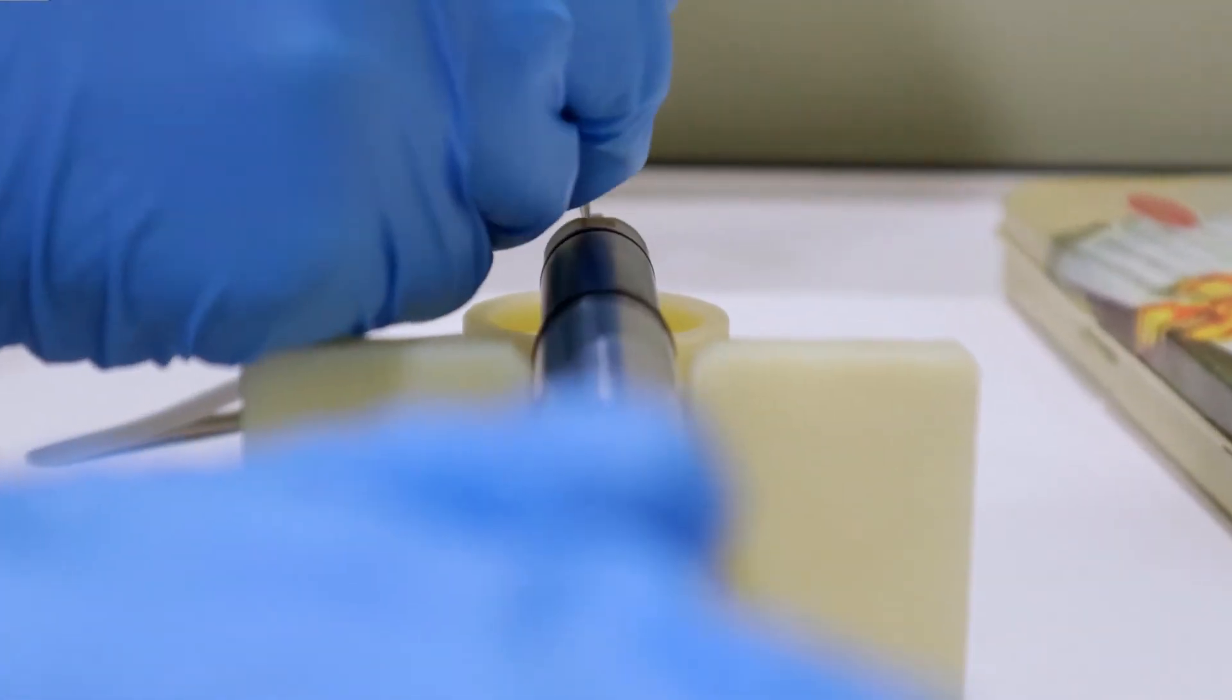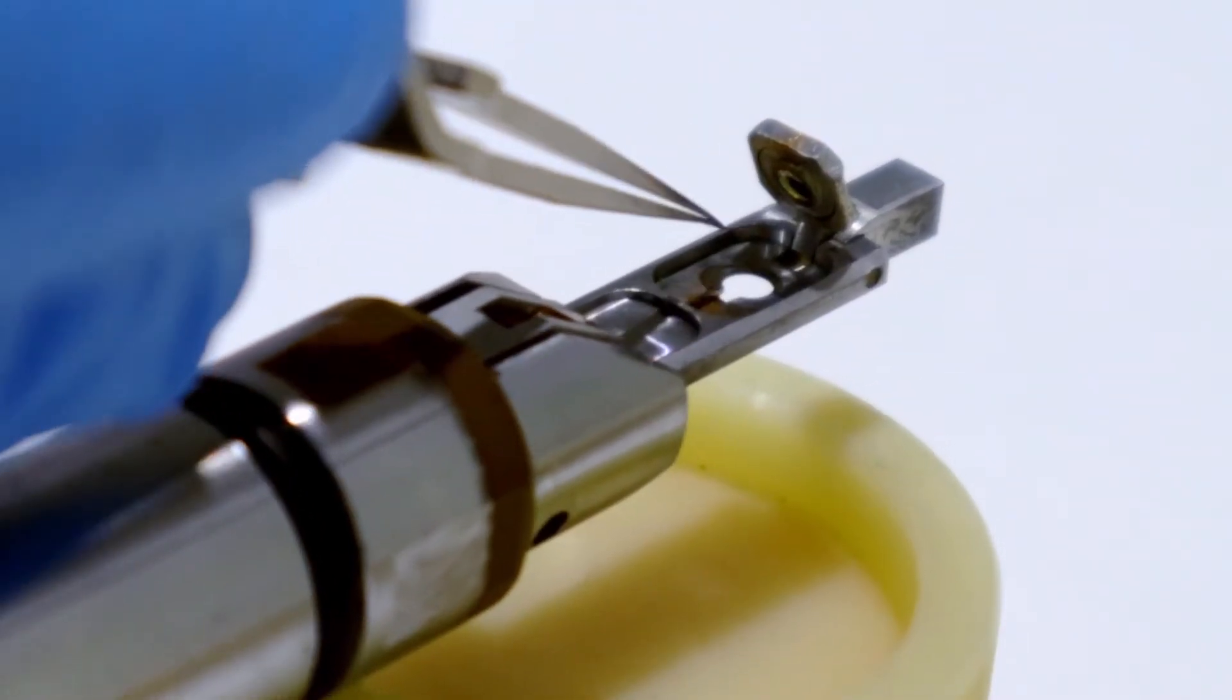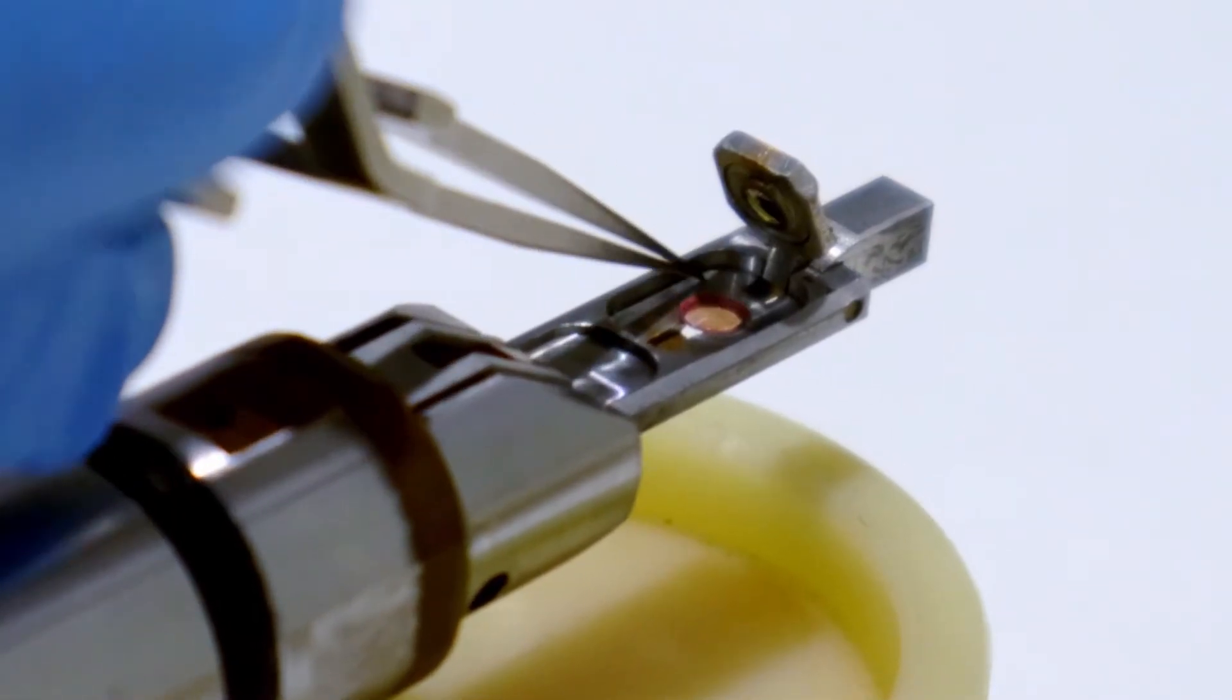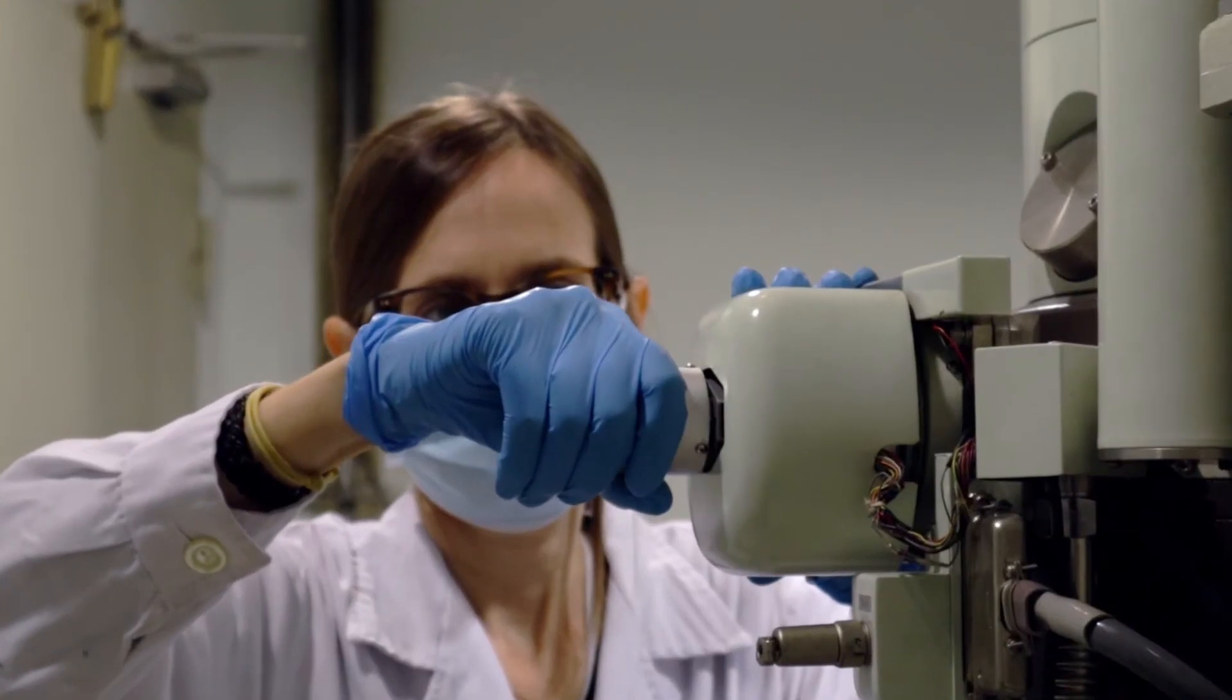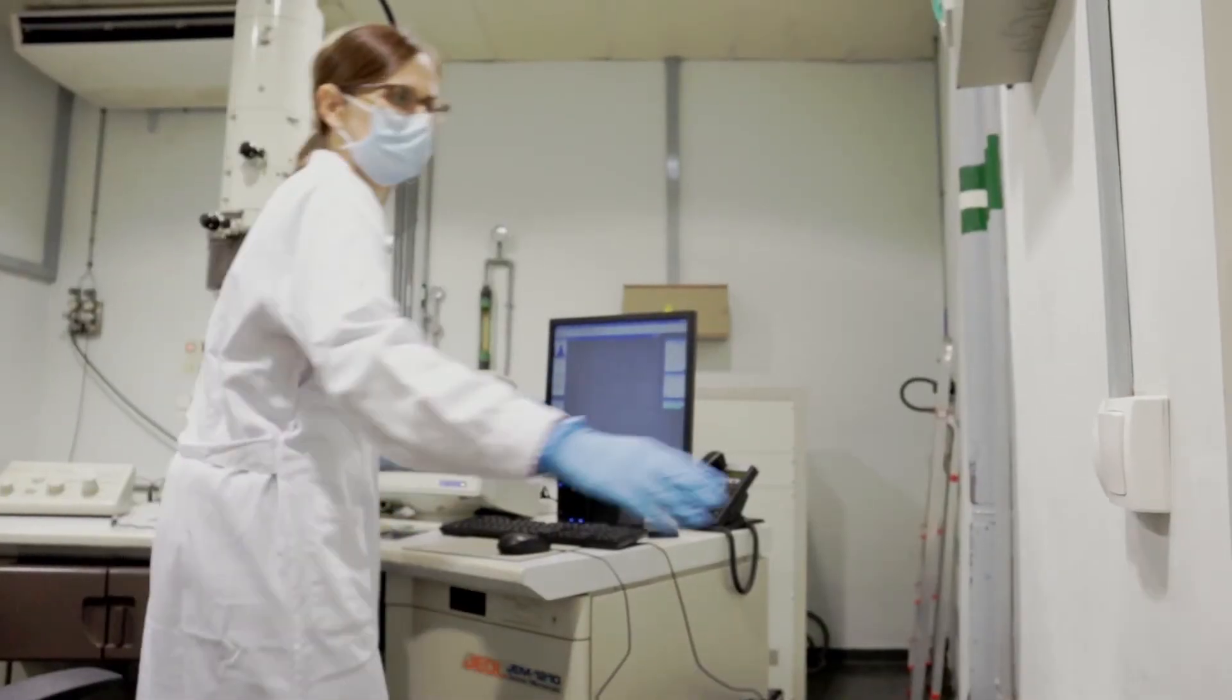We prepare the sample in a small support, which goes inside the microscope in high vacuum. In TEM, the electron beam does not bounce off the sample. It goes through it, so it needs to be very thin. The electron beam is transmitted through the sample to form the image, which we see on the computer.